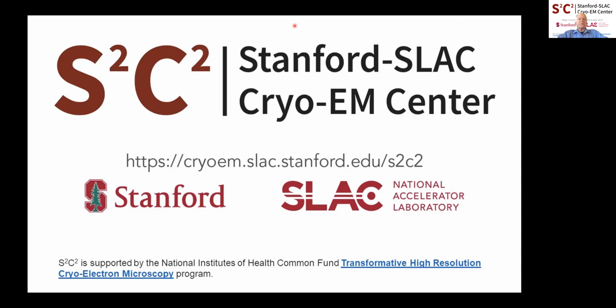And we have, as the Pacific Northwest one does, and of course NCCAT, different types of access for high resolution data collection, including a newly instituted one called exploratory access, which is designed for quick access to interesting projects. We have a special COVID one for COVID related research. So these kinds of access are available.